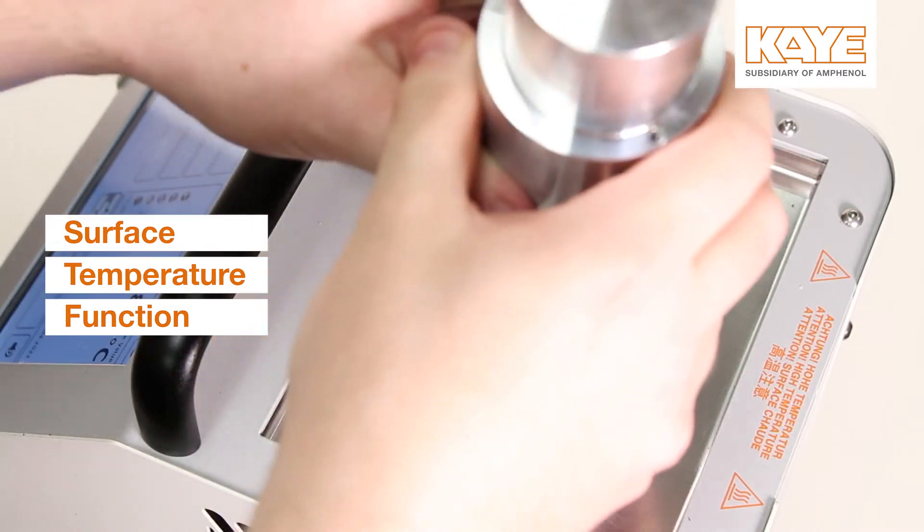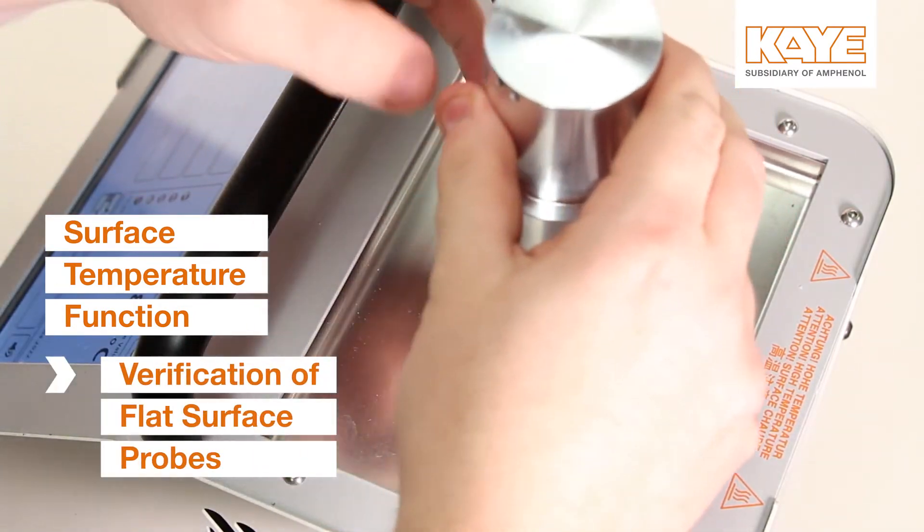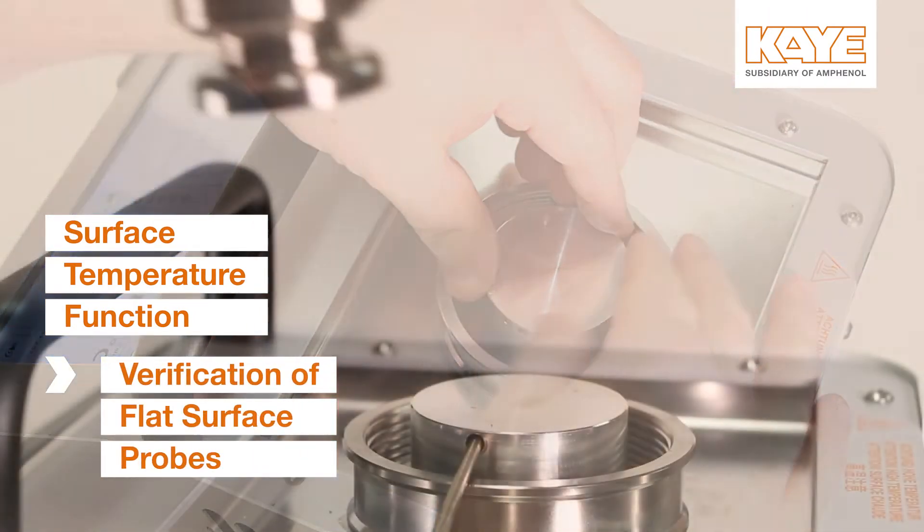The surface temperature insert allows for calibration and verification of surface probes, such as the Valprobe RT.